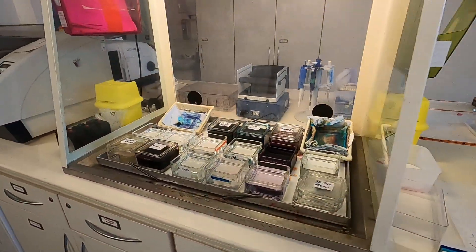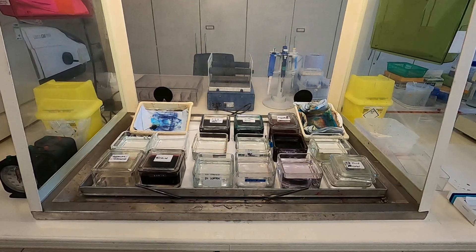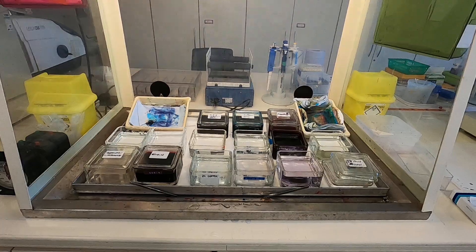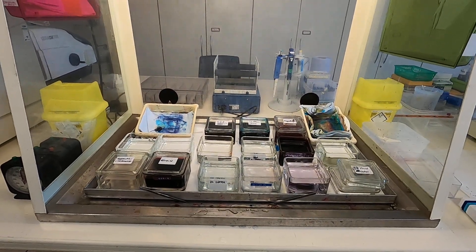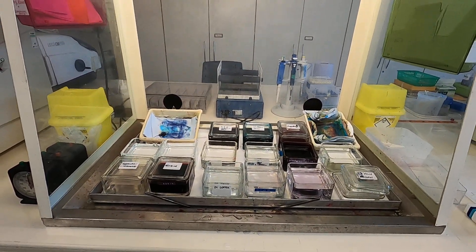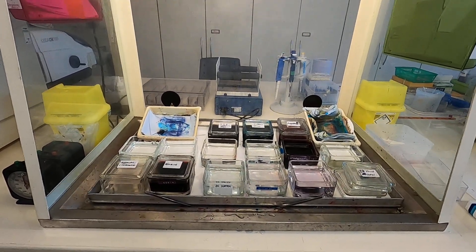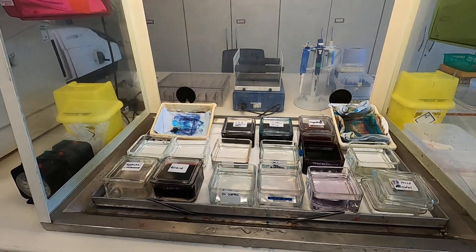You have a staining station, and the staining station enables you to stain up tissues using a variety of different colors to highlight specific tissues. One of the ones that you will use a lot during your time at the university will be hematoxylin and eosin, and this is set up to do that one there. We'll do a separate little section all about that.